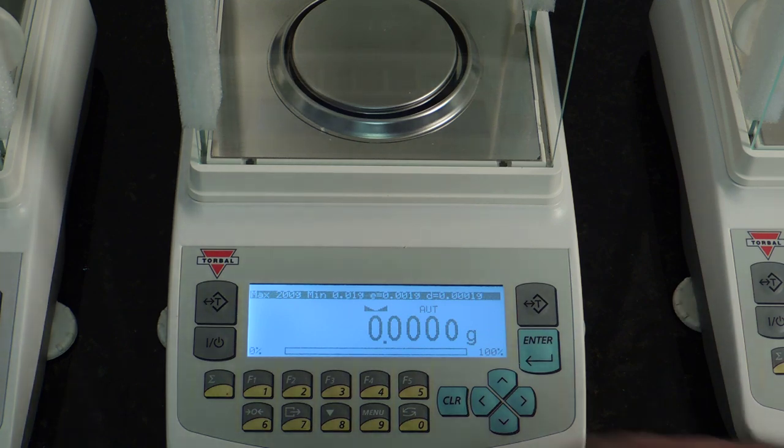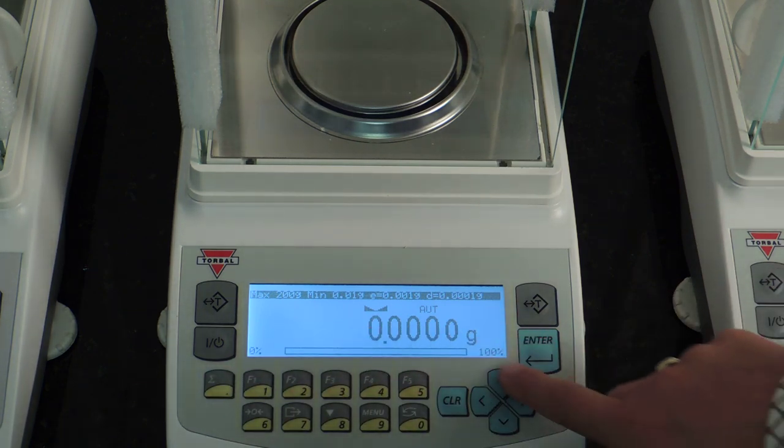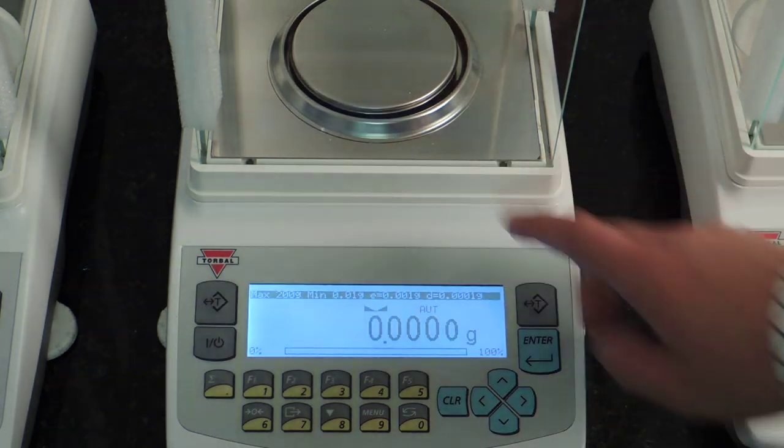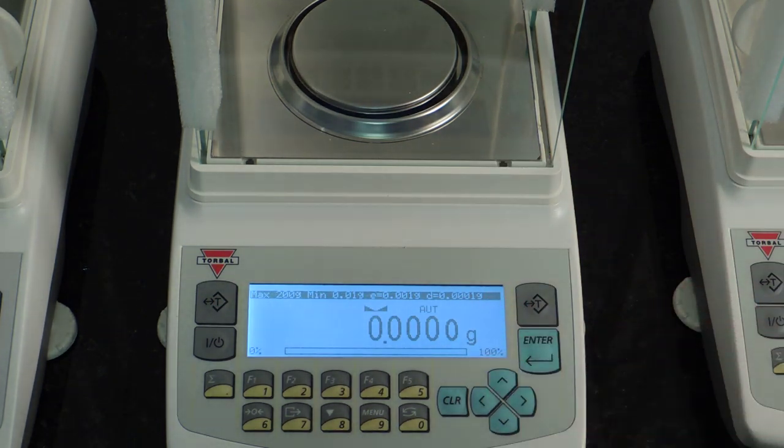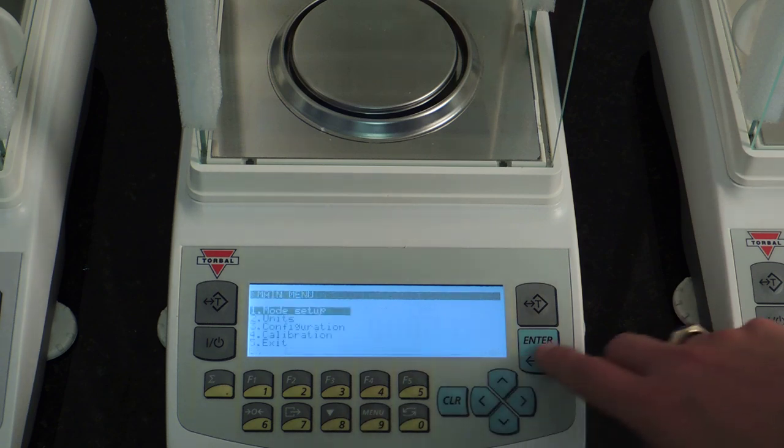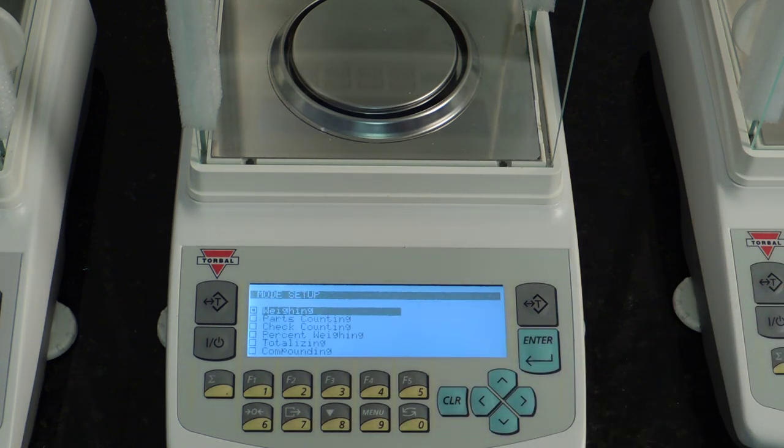Very intuitive balance to use, numeric keypad, navigation keys, dual-tier keys, and the graphical LCD display. Many of the functions that you have in the scale include on-screen instructions, which make the scale very easy to use.